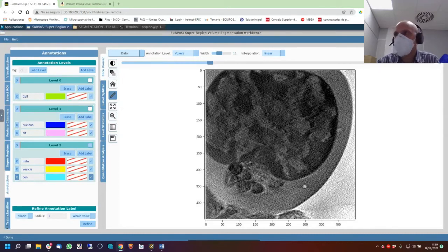They are more or less clear how to play with this. But more or less the tricks that we have here, the dilation, the opening and closing, they are not so easy for this, but it's in order to separate or join blobs.